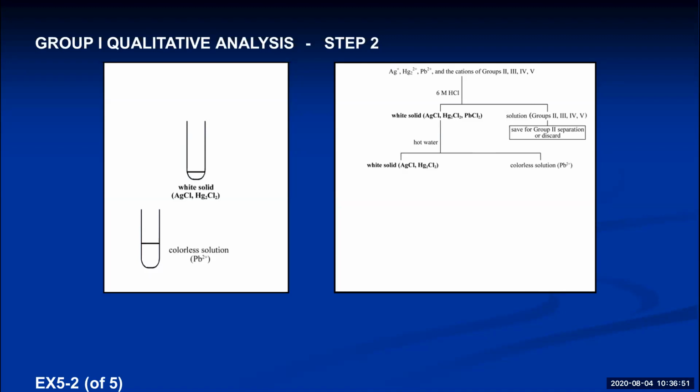Now, how do we know we have lead 2 ions in there? Well, what does the solution look like? It looks like a colorless solution. So that's really the problem in Flint, Michigan, right? If you have pure water or water that has lead ions in it, you can't tell there's lead ions in there. We haven't proven there are lead ions in there. You have to do something to verify that that colorless solution is not pure water, but actually has lead ions in it.